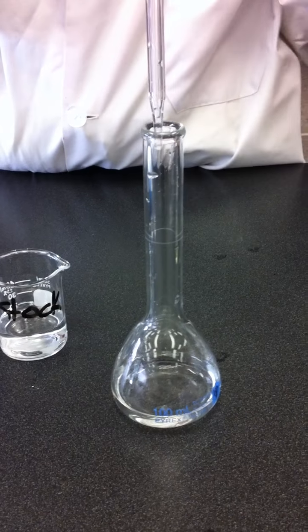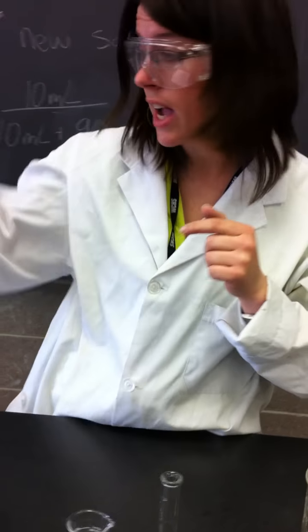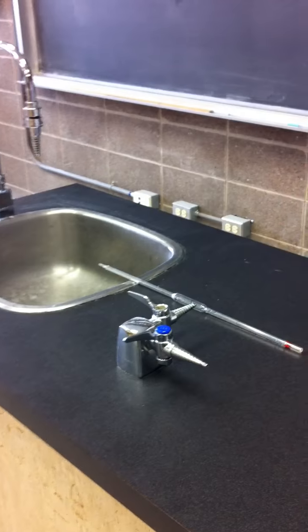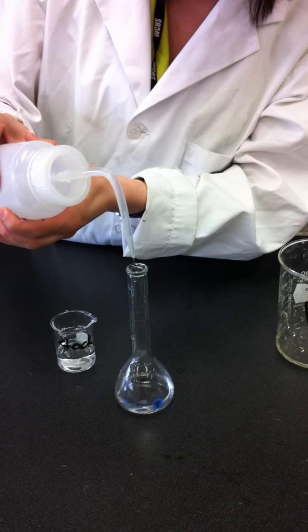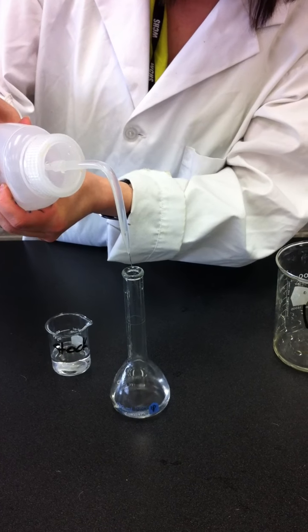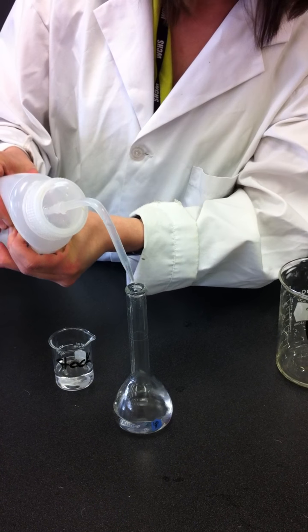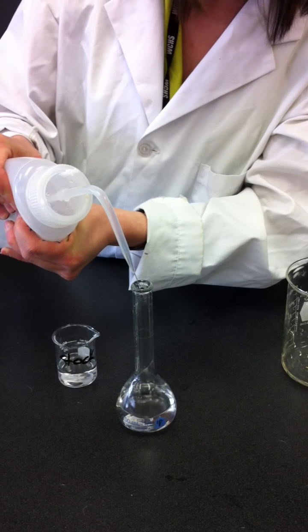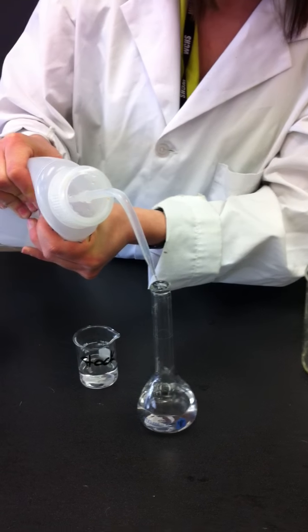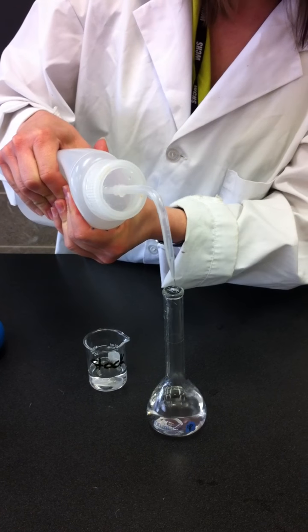All right. So now I don't want to put this tip on my counter because it's got a strong acid, so I'm just going to put it over top of the sink. And then I'm going to fill my volumetric flask up to the 100 ml line. When I get very close to the top, I will use a mini pipette or an eyedropper. So you've done a dilution before, and you've certainly made a solution, so this part you know how to do.